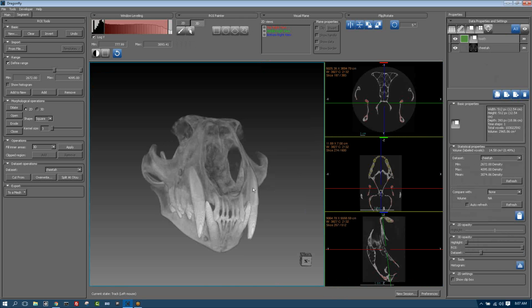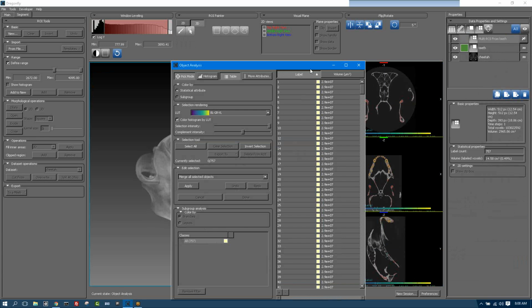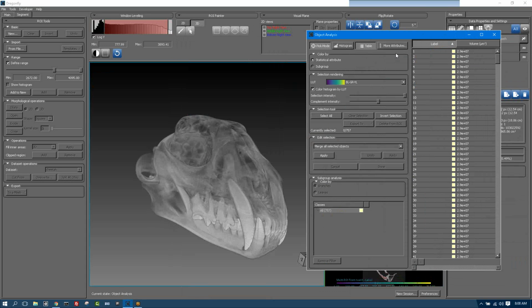Now what I'll do here is I'll take this data set and I'll tell it to do advanced analysis, which is going to separate the individual renderings, separate the individual labels. So what it's done here, it's not going to be clear at first, is it's identified all the separate segmentations that it found. Now, if these are all connected, then it'll just be one lump segmentation. And then if you have a few isolated pixels, they'll be separated out individually.